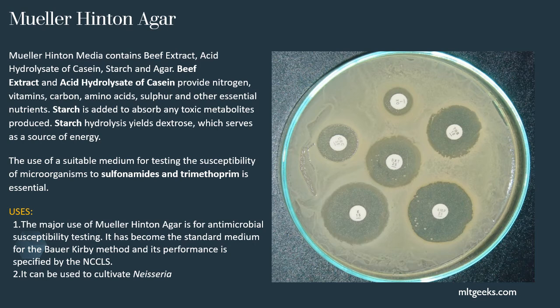We use swab or spread plate technique to have a mat growth, right? And then we inoculate antibiotic discs, or we do well inoculation for antibiotics, and then we keep it for incubation, and next day we see if there is any zone of inhibition. So that is how simply an antibiotic susceptibility test is done.